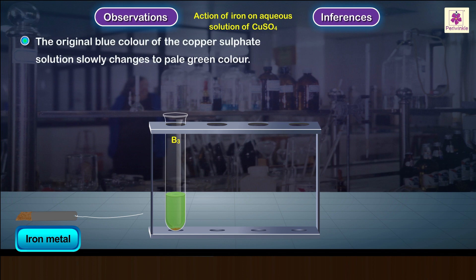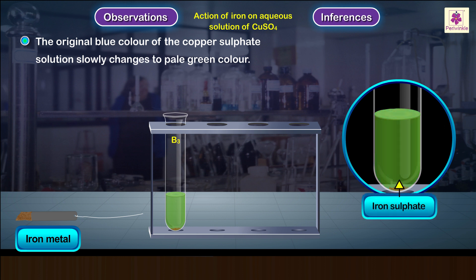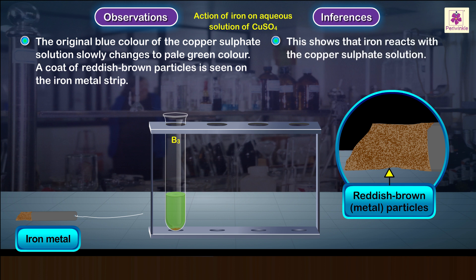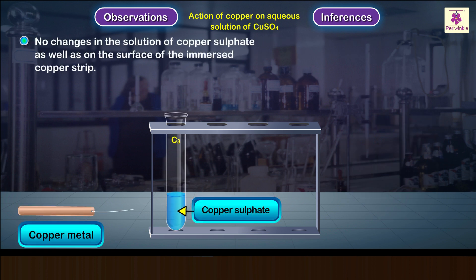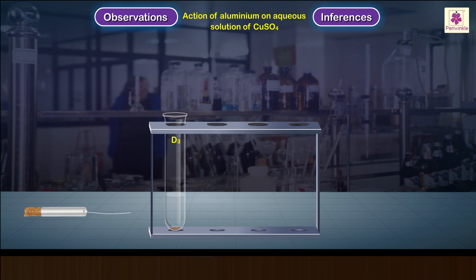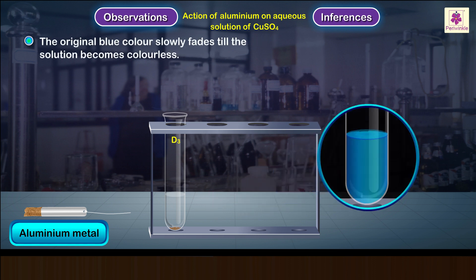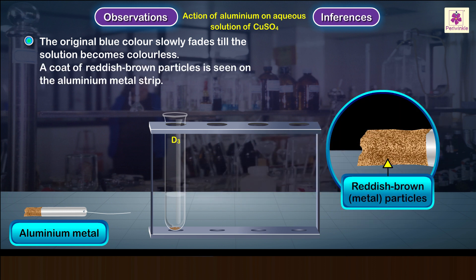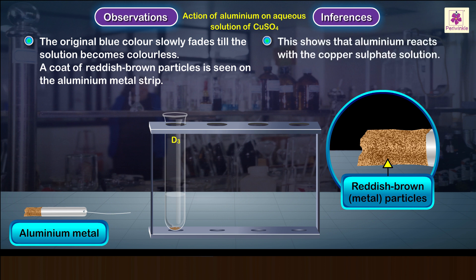Test tube B3 containing iron metal: the original blue color of the copper sulfate solution slowly changes to pale green. A coat of reddish-brown particles is seen on the iron metal strip. This shows that iron reacts with the copper sulfate solution. Test tube C3 containing copper metal: no changes in the copper sulfate solution or on the copper strip surface — no reaction. Test tube D3 containing aluminum metal: the original blue color fades to colorless and a coat of reddish-brown particles is seen on the aluminum strip. Aluminum reacts with the copper sulfate solution.